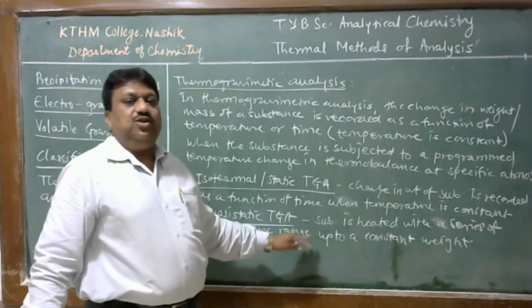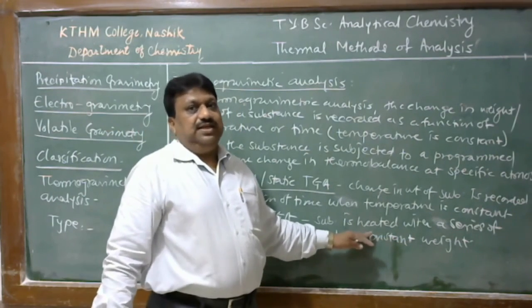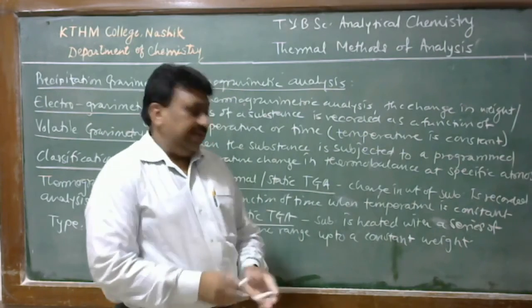Therefore, until the weight of the substance is constant, the series of temperatures is increased.